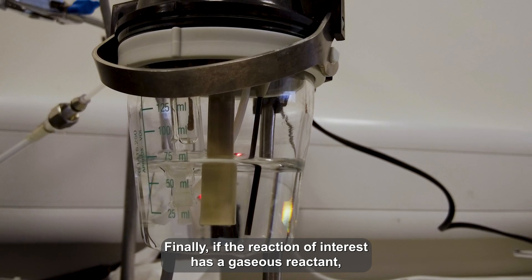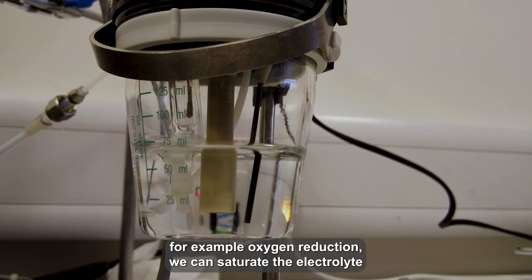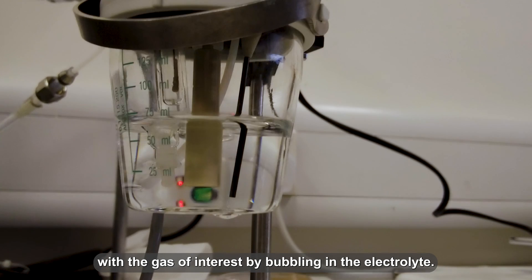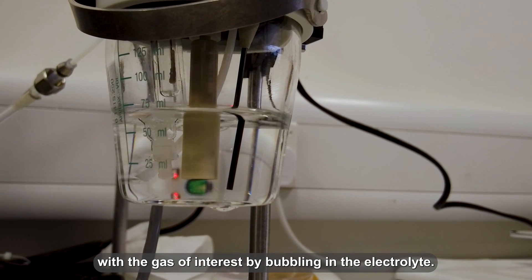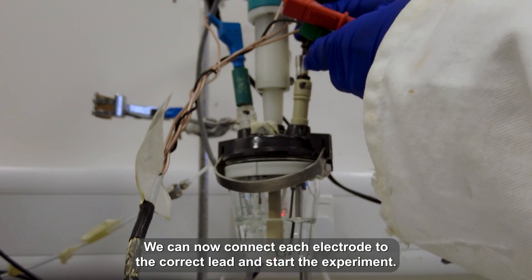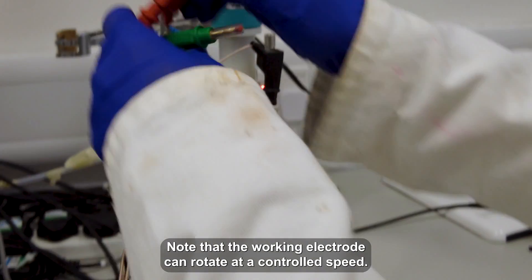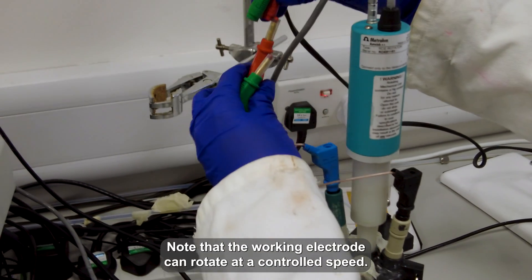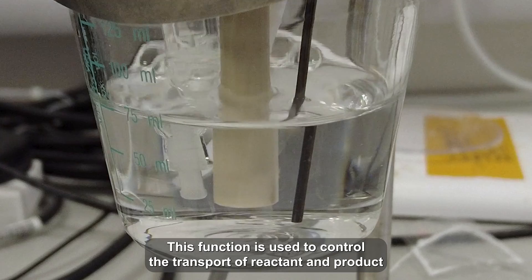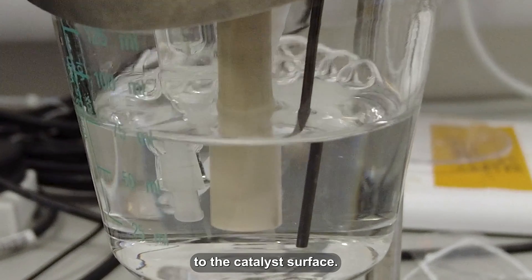Finally, if the reaction of interest has a gaseous reactant — for example, oxygen reduction — we can saturate the electrolyte with the gas of interest by bubbling it into the electrolyte. We can now connect each electrode to the correct lead and start the experiment. Note that the working electrode can rotate at a controlled speed. This function is used to control the transport of reactants and products to the catalyst surface.